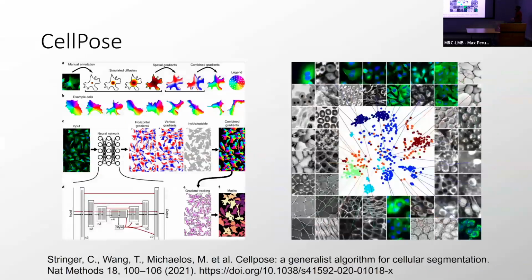For cell segmentation, for now, Cellpose is very efficient. It's another approach which can use two channels for cell segmentation. We could use the nuclear channel and the membrane labeling, for example, or cytosolic labeling.